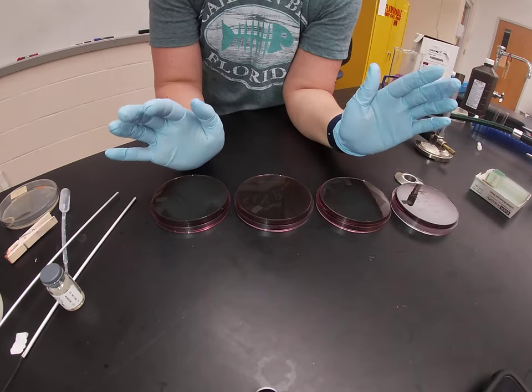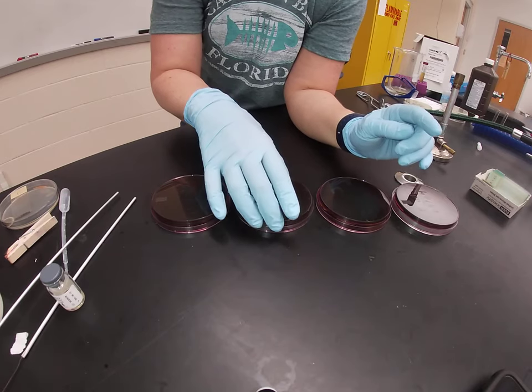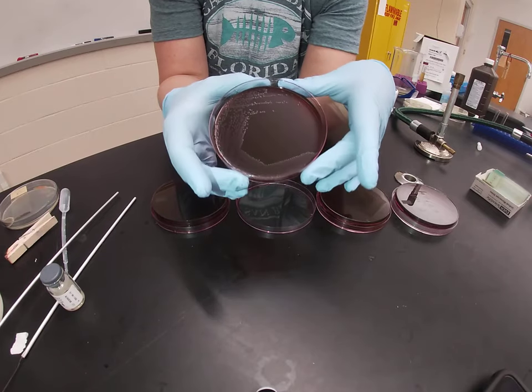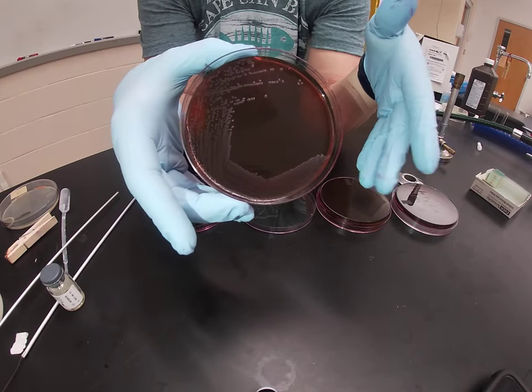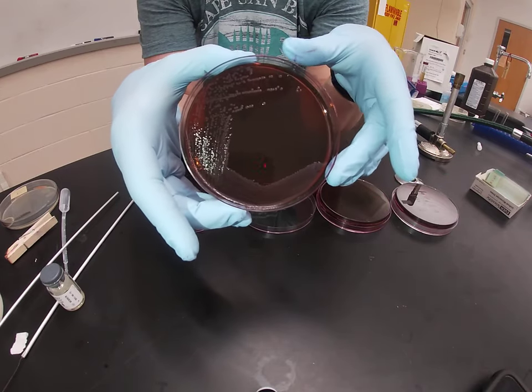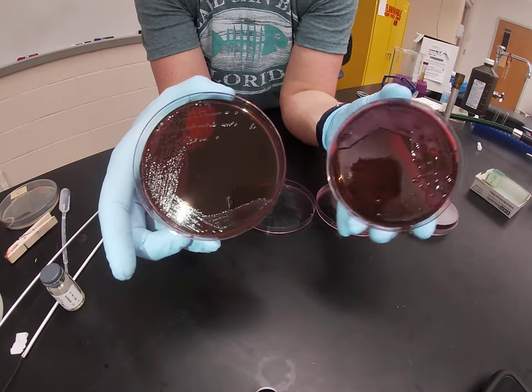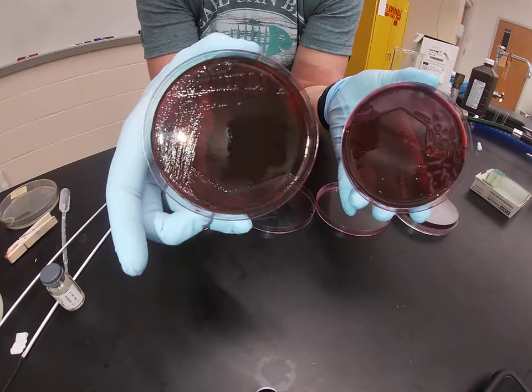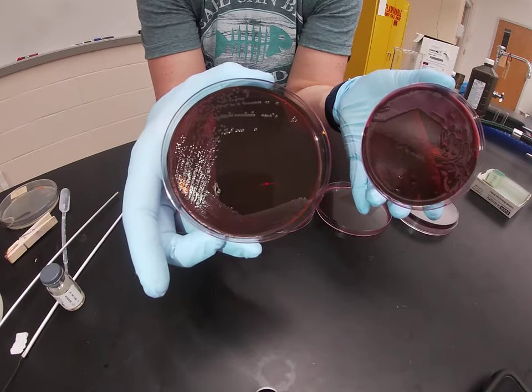Organisms that are gram negative and can grow on EMB but do not ferment lactose grow clear on this agar. But it's not uncommon for them to still look just a little bit pink because they're growing on a pink agar — you're able to see through them and they look a little bit pink. The pink you see for a fermenter is very different and distinctive from the slight pink picked up from the agar for those not fermenting lactose at all.